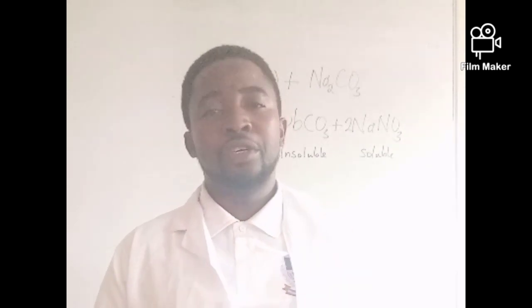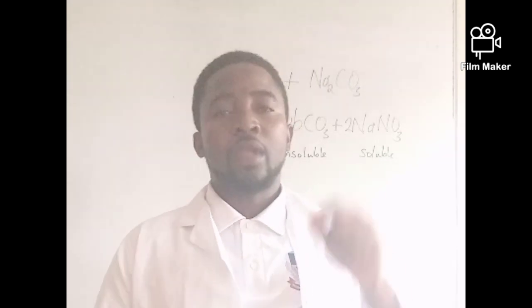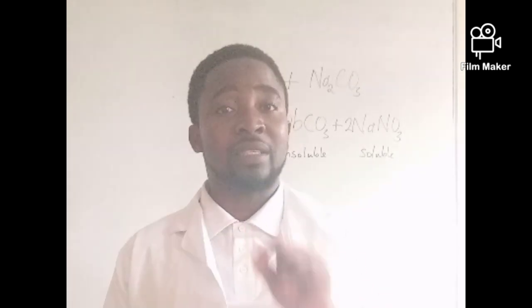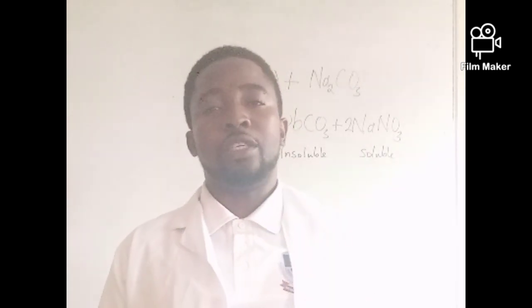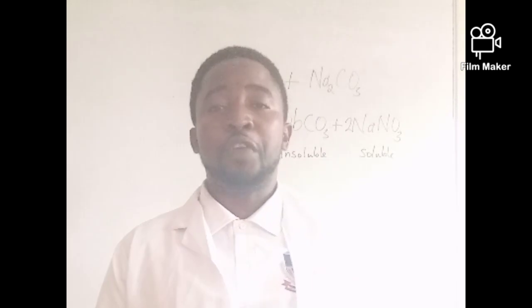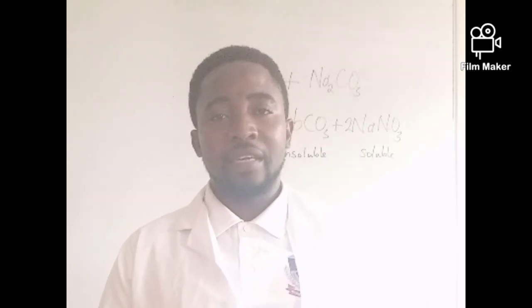Now the next ion you will be expecting in this qualitative analysis is trioxocarbonate 4 ion. Of course, in a trioxocarbonate 4 ion, there is a gas that we possibly test for, and that is carbon 4 oxide. When you add an acid to a trioxocarbonate, effervescence occurs and a colorless, odorless gas is evolved. And that gas, if it turns lime water milky, is obviously carbon 4 oxide.